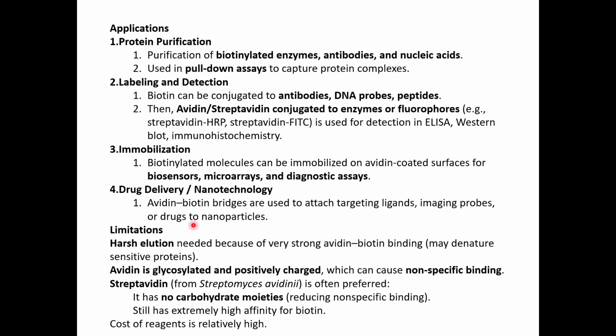Then there are also certain limitations for this, although it is very widely used. Sometimes, when used in case of your affinity, harsh elution is needed because the interaction, like we spoke, is 10 power minus 15 molar interaction. The dissociation constant is, so it's a very, very strong interaction.